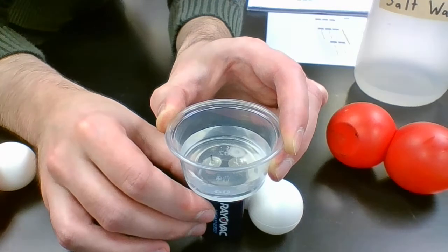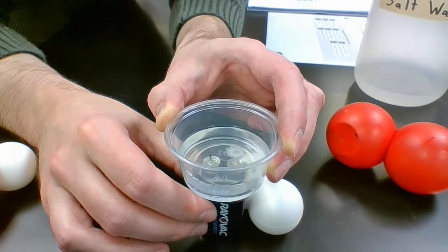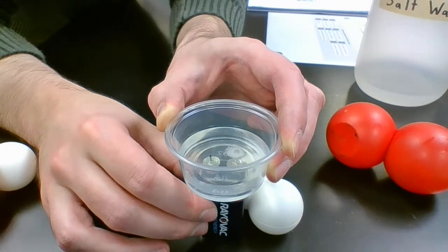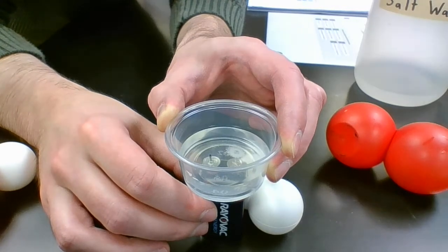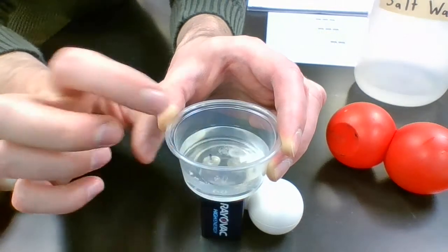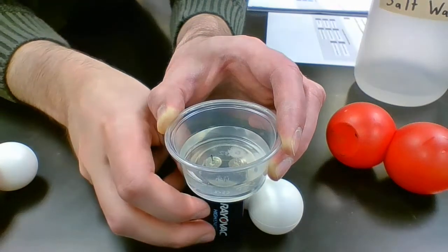Well, what happens when you put together metal and water and oxygen together? Well, like we saw with the rusty block and the rusty sphere, you rust it. We corrode it or oxidize it. Those are all different words for kind of the same thing. So that's what's going on here. We don't see the little bubbles of oxygen because they immediately go and rust and react, corrode this metal tack right here. They don't even get the chance to escape as a gas, as little bubbles. They just immediately go and react.